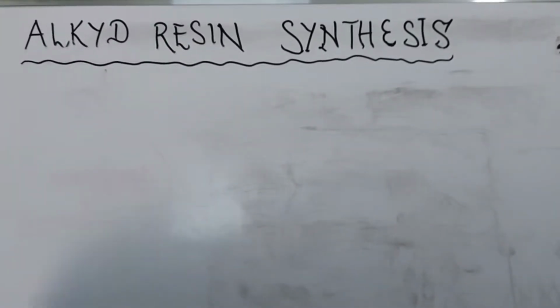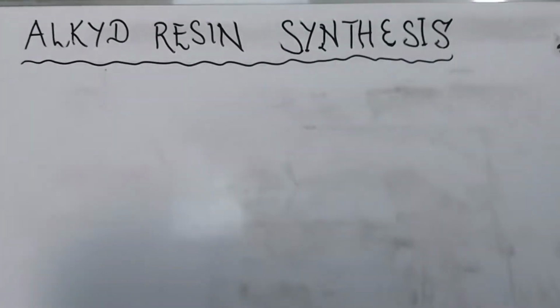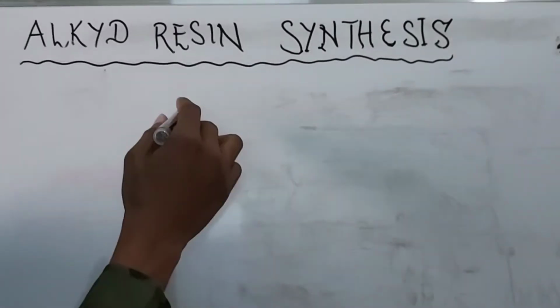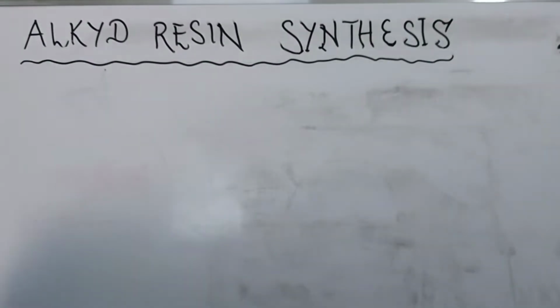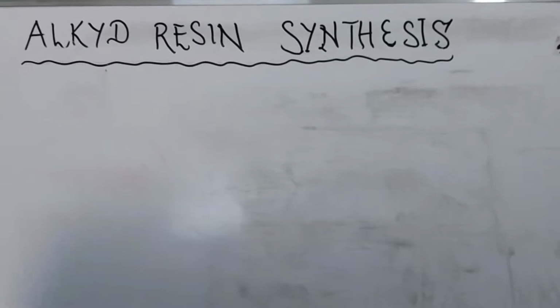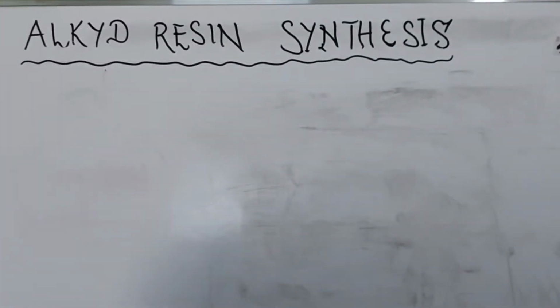A resin is just the binder that's used in the varnish, that's the paint formulation, and I've explained that previously. And the Alkyd derived its name from alcohol and an anhydride. That's where this name came about. So the synthesis is what we're going to consider, and there are factors that you need to consider, bearing in mind that we'll be making use of an oil.